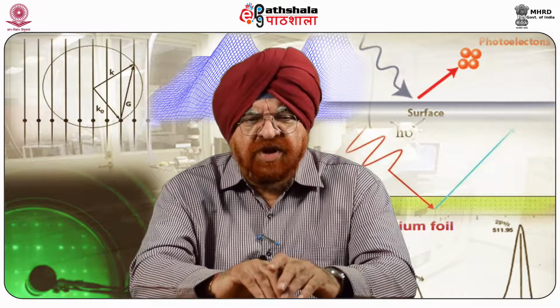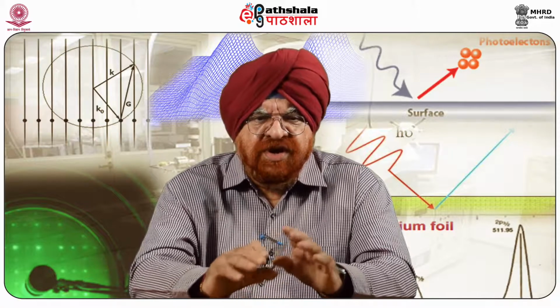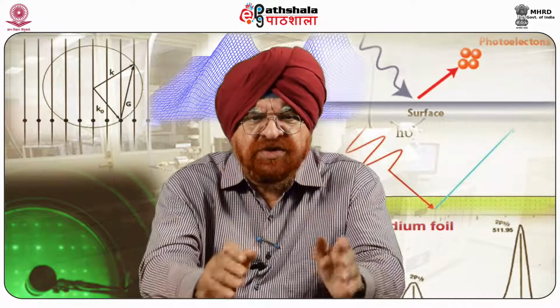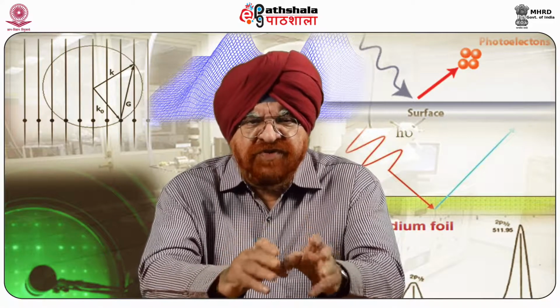Its height profile as obtained by AFM and the corresponding MFM voltage along the horizontal, vertical and diagonal dashed lines drawn in A are represented in B, C and D respectively. Note that the MFM voltage pattern due to the presence of magnetic vortices in the structure is a little more difficult to record.